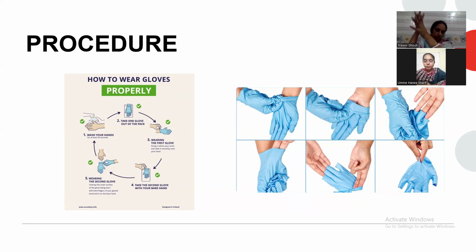Yes, I can. Yeah, sanitize our hand. Then take our gloves. Make sure you choose the right size for your hand. Like, if you need M size, you cannot choose the S size gloves. And then what we do, like that person showed, we wear it like this, making sure our fingers fit.